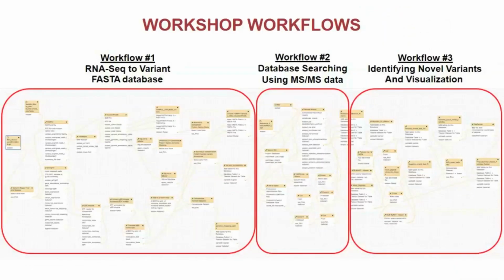So the third workflow, which I think is the most interesting, because these two workflows, maybe the second one, you can use any other software to do it. You have an MGF file, you have your RNA-seq generated protein FASTA file, you can use any search algorithm to get your outputs. But these two workflows, with the work that we have done, hopefully help you get it done more easily on your datasets.